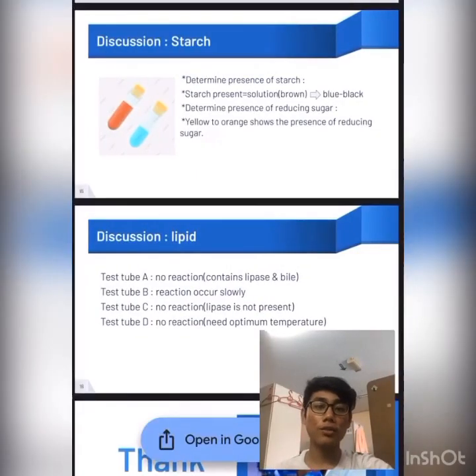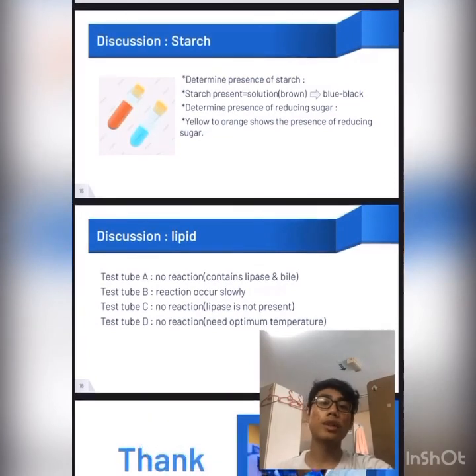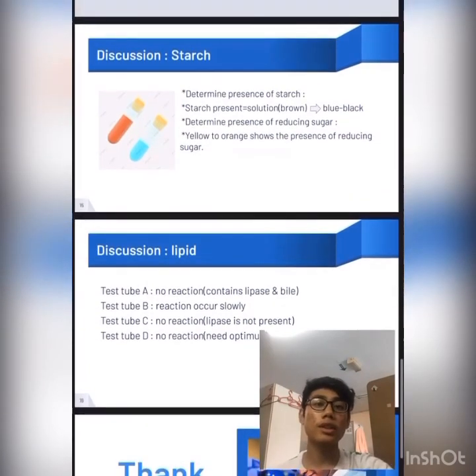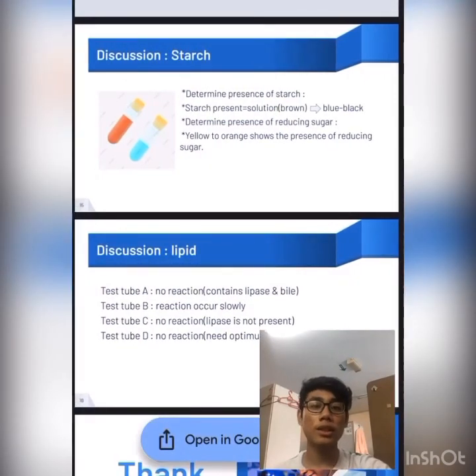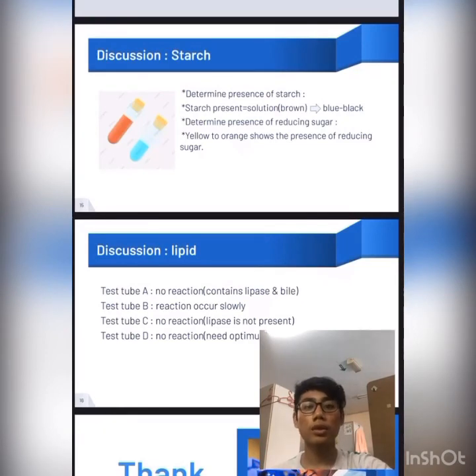Hi and assalamualaikum everyone. Today I want to discuss the digestion of starch and the digestion of lipid for discussion. Before that, my name is Amir Khalid bin Baharudin and my matric number is AS11542. So we go to the digestion of starch for discussion.